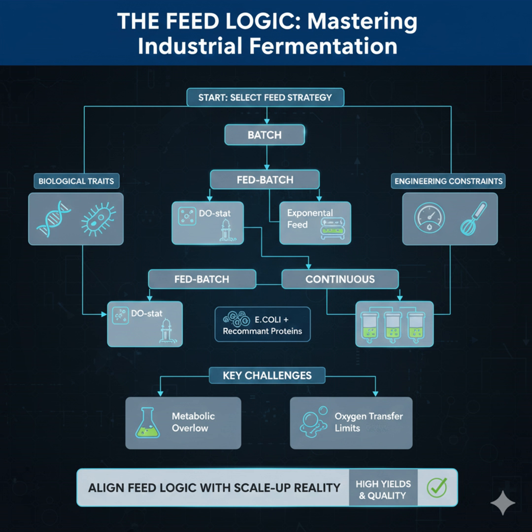So the rule is to build in a safety margin. The critical rule is always to choose a level 2 or 3 strategy that builds in a safety margin. A ceiling maybe 20 to 30% below your maximum OUR limit at top scale. That safety margin is priceless. Yeah. Okay, let's bring all this home now and connect these technical decisions directly to what really matters.